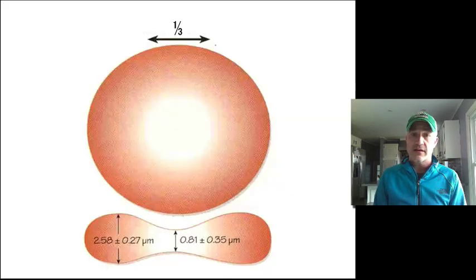And you can see at the bottom of the slide here that it is that biconcave disc, again giving us a lot of surface area for not a lot of volume.